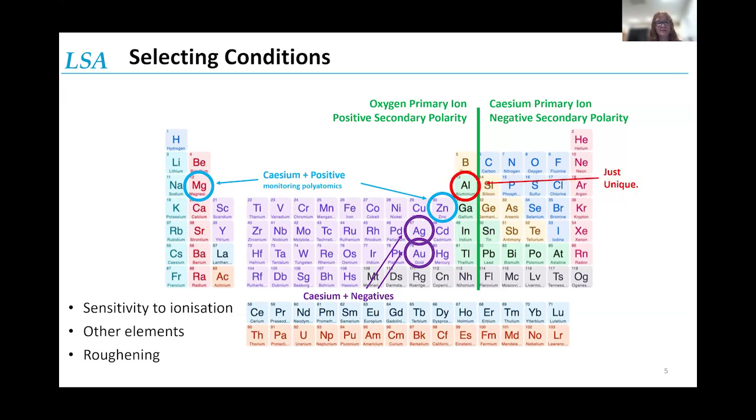And then aluminium. Aluminium causes havoc to most analysis that we're running. It really likes ionizing and improves the ability of the surrounding atoms to ionize and increases their number of counts. So we have to, or should, take into account the aluminium content in the material and its influence on the ability of the element of interest to ionize.